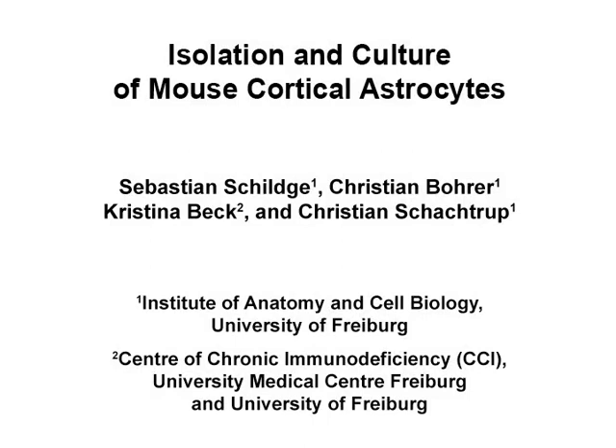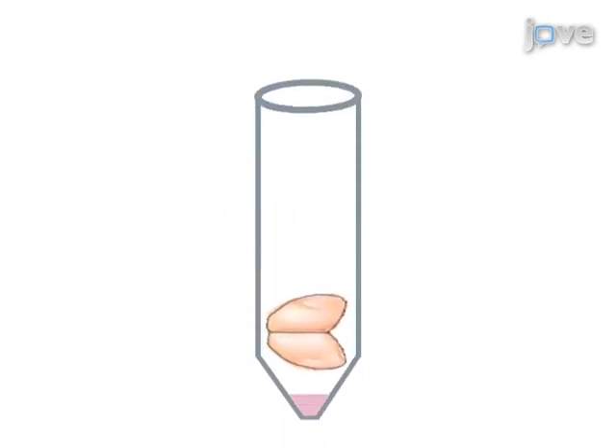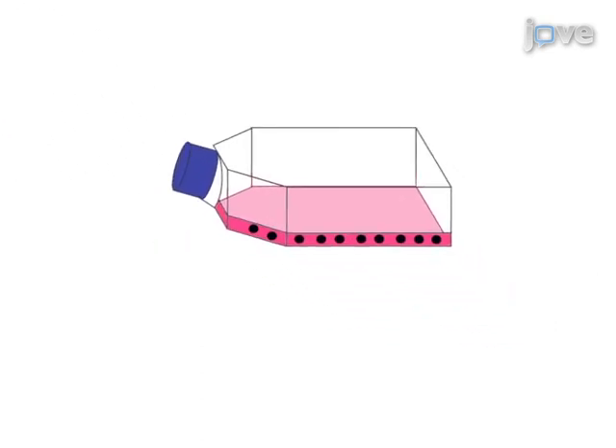The overall aim of this procedure is to obtain pure astrocyte cultures by isolating and culturing mixed cortical cells from P1 to P4 mouse pups. This is accomplished by first harvesting brain cortices of mouse pups and removing the meninges, then cutting the cortex into small pieces, dissociating the cortex pieces by trypsinization and trituration to obtain single cells, and plating the single cells on polydelysine-coated tissue culture flasks.